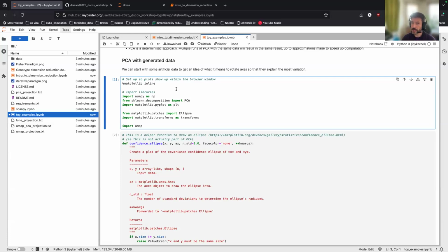Because sometimes the signal for a cluster, for a cell type or a subtype, might not appear until PC 14. So computation is cheap. Run a script that does pairwise comparisons, like the top five or six. And when you're working with a method that uses UMAP or t-SNE, change the default number of PCs and maybe even change the parameters in UMAP and t-SNE, which you can ask me about later if you'd like. But definitely examine more than just the top two PCs.